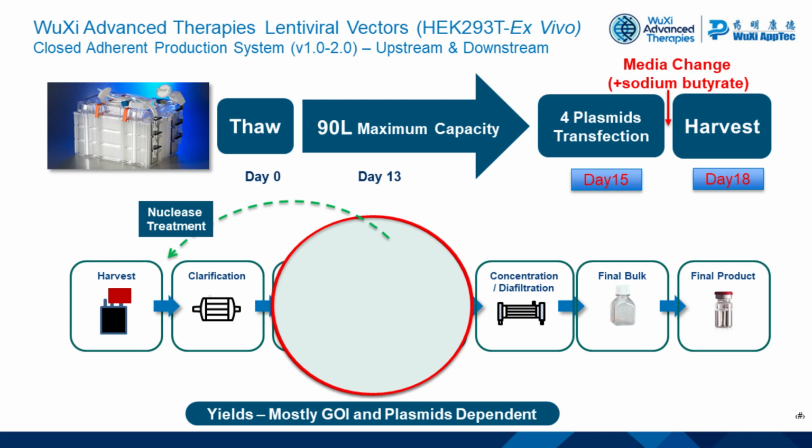Thanks, Xin. That was a wonderful presentation. Here is the downstream part of the Lenti 2.0 platform. Here is the overview of our original Lenti 1.0 platform, which was launched in 2017. I would like to share the process improvements we made to increase the titer and recovery.